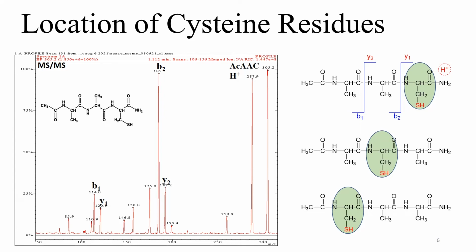What was important about having the cysteine where it was is that the misfolding will occur because the two cysteine residues of the active site form bonds where they shouldn't. Therefore, if we synthesize small peptides like this, we can better understand how the location of cysteine really matters. Using the mass spectrum is just an example to reflect how even the ionization fragmentation patterns are different.